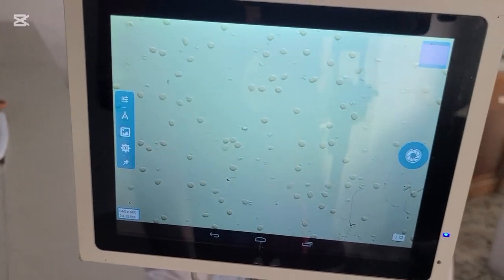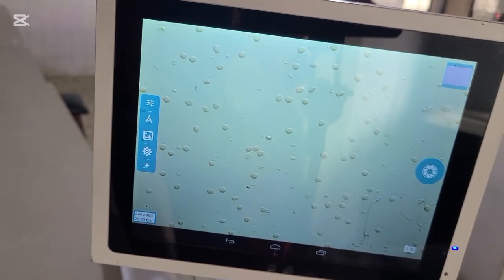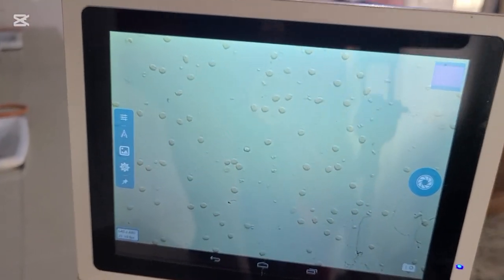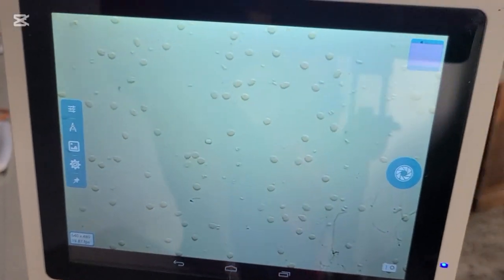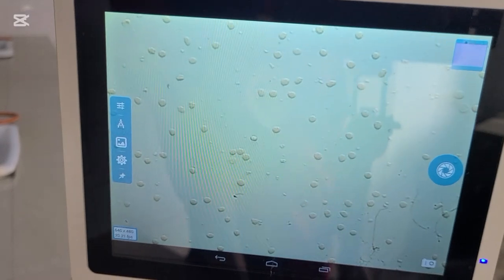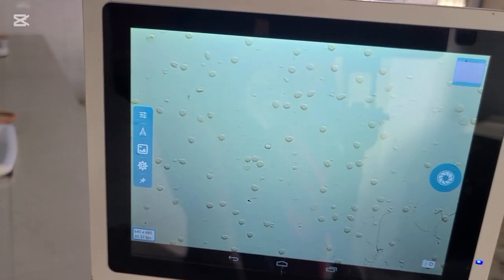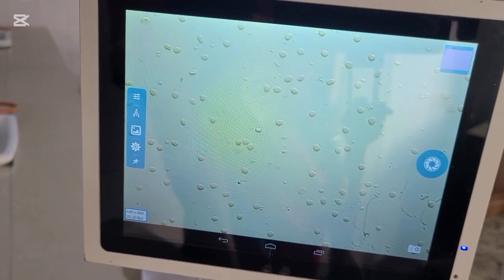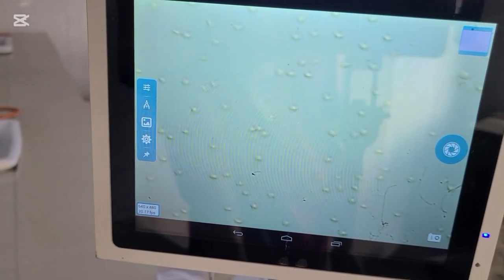So now, in this, like I said, I forgot to mention that your red blood cell is also graded in pluses, the same way we grade the epithelial cell. So if you look in this particular field, now you see that there are more than 10. So you know you can say this is 3 plus, or you can say many. Sometimes when you look under the microscope in a particular field, and you see that the particular parameter is just everywhere, like a red blood cell is just everywhere, you can call it many. Like this now, it's just everywhere on this field. You call it many.